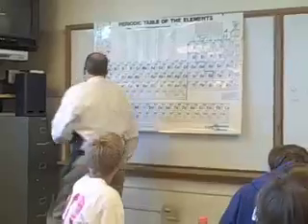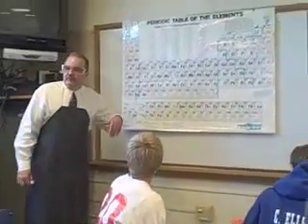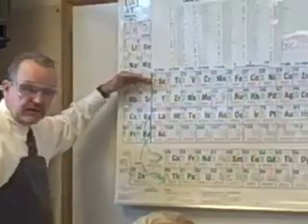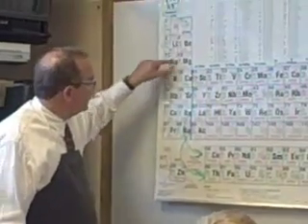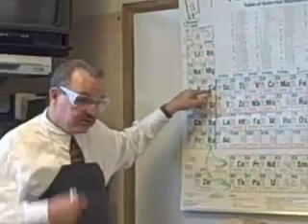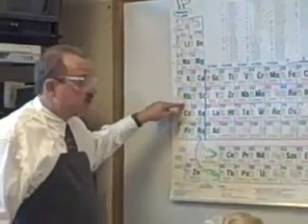Okay. So what this demonstration is supposed to show you is that as you move in this direction, activity increases. All three of these are more active than calcium. And then what's the other trend? As you go down, they increase.